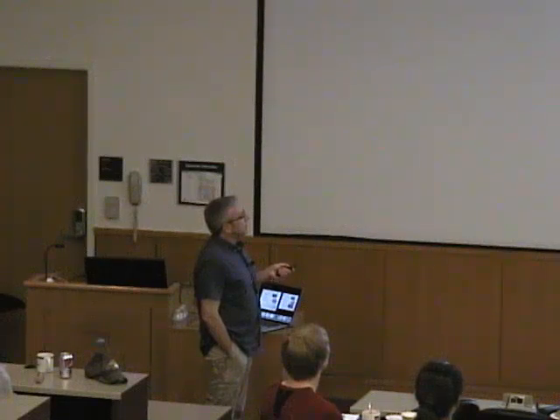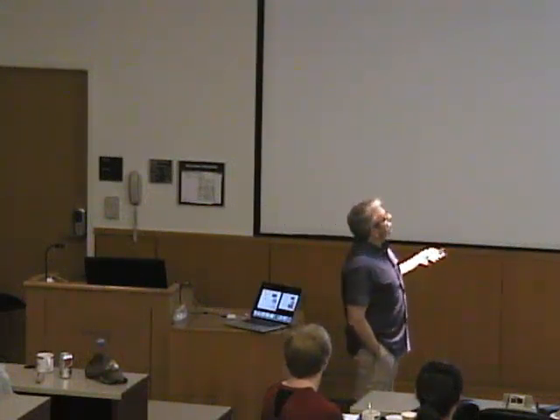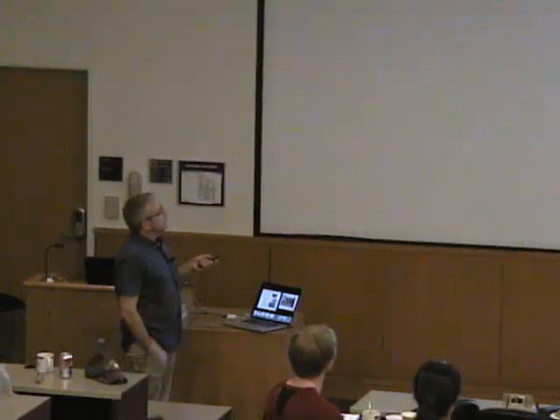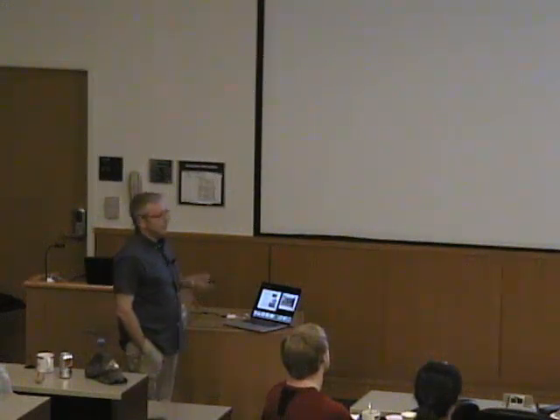But of course, there are many reasons to go to higher intensities, either to get better data or, and that is something I will get back to, in order not to be limited to a single wavelength, because these guys only produce one single wavelength. And then you would have to go to synchrotron sources. These are, of course, slightly bigger. So this is what, every group might have several of these. Every university might have one of those, and every country might have a few of these.